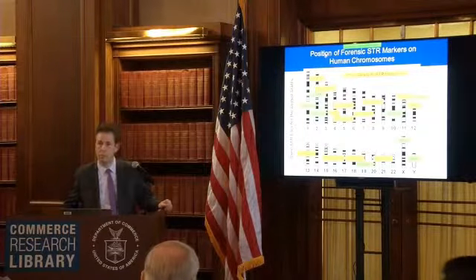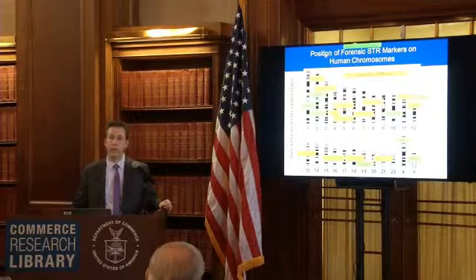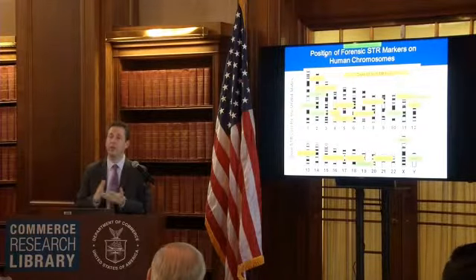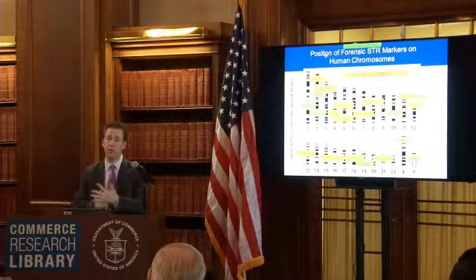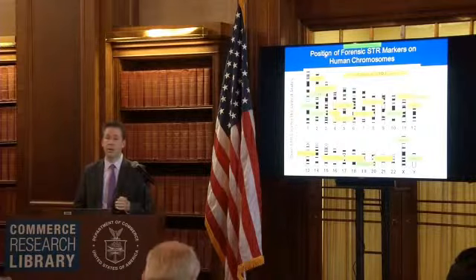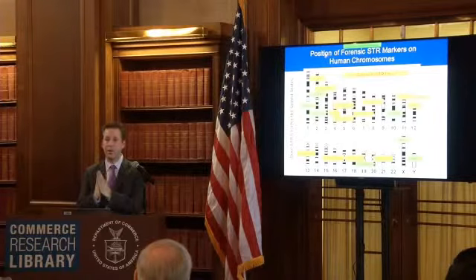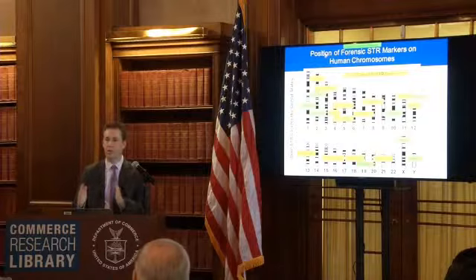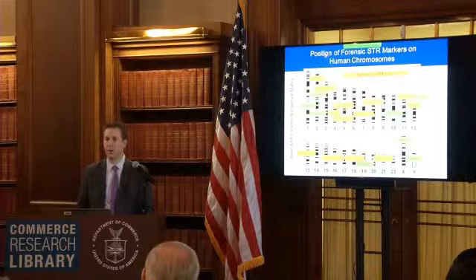Yeah. Is the error rate in determining the number of repeats essentially 0? I would say yes. With something like 7 repeats, you don't really see an error with that. It's reviewed by an analyst. We'll show it a little bit later, but there's a ladder that helps size that up for you. There might be errors in interpretation, potentially, but usually there's not an error associated with the identity of 7. You don't say that's plus or minus, there's like a 5% chance it could be an 8, or a 4% chance it could be a 6. It's usually set as ordinate or identity information.